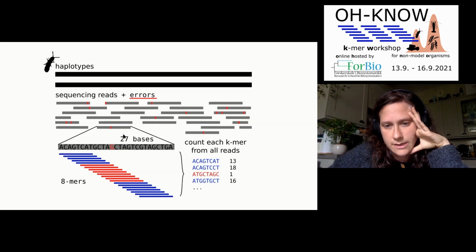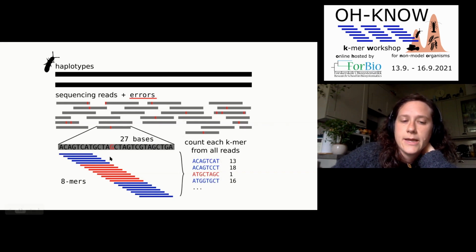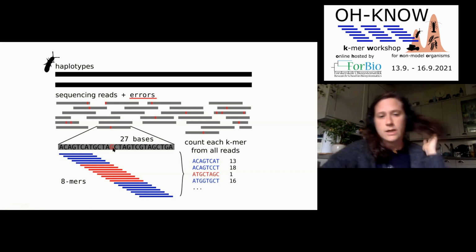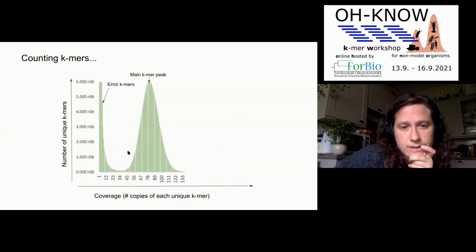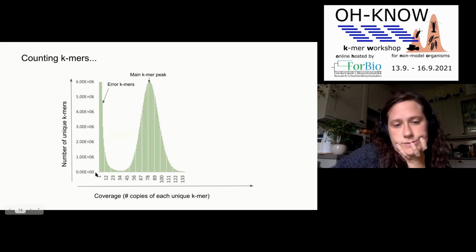However, we know that sequencing has errors, and we've talked about this as well, and how the different random sequencing errors can affect our Kmers and the specific amount of Kmers. One sequencing error on a read can affect a number of Kmers, but the count of those Kmers, because they are random, is very low. So that's why on our spectra, they will just show at a very low coverage right next to 0. But they will be in very high amounts.